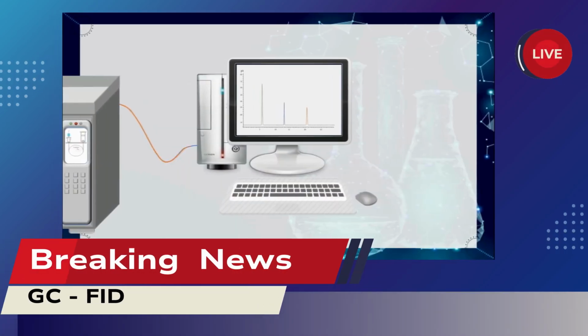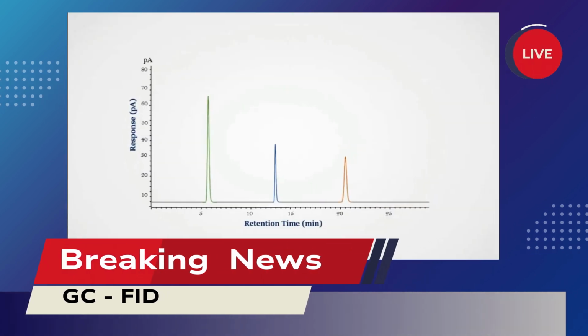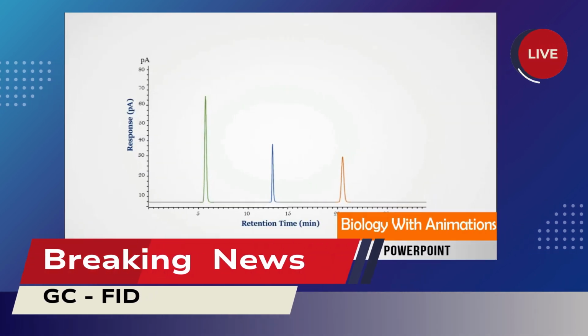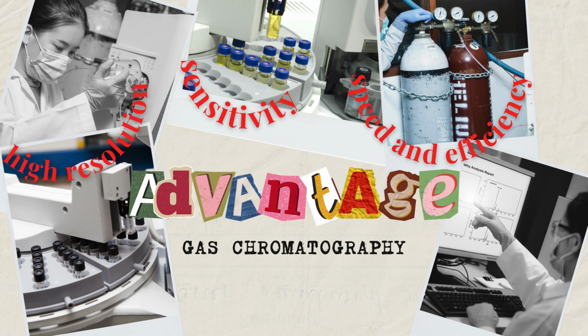The data is displayed as a gas chromatogram, where the x-axis represents the retention time, showing how long it takes analytes to pass through the column. The y-axis reflects the quantity of each analyte, represented by the area under the peak.